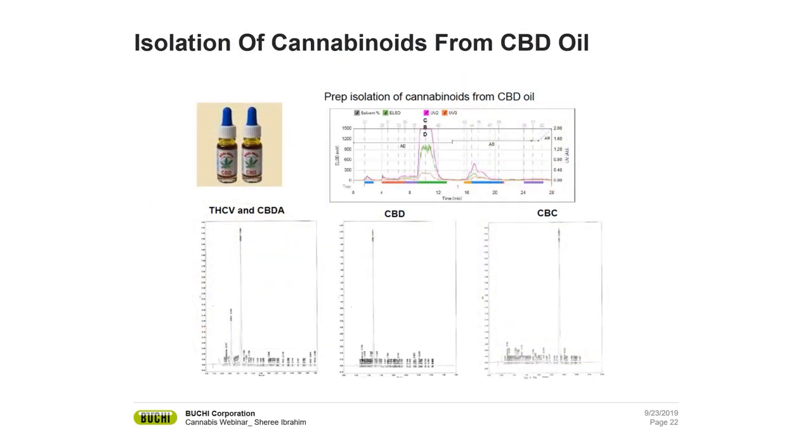We did some research on CBD oil, so we purchased CBD oil from the market to do the separation. We were able to separate THCV, CBDA, CBD, and CBC. And as you could see here, the separation was successful and we obtained a very pure CBD purity.